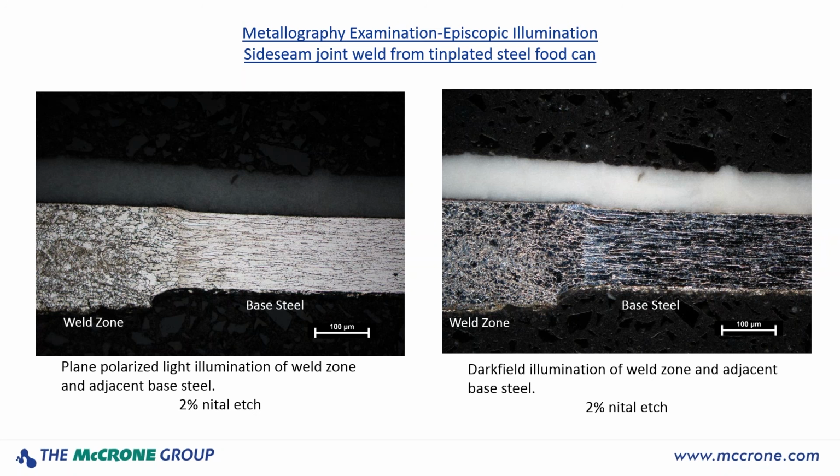And those reflections coming directly back up are actually blocked in the objective system so that we wouldn't see that. We're seeing the scattering of light due to angles and topography differences and so forth. So anything that's very flat is going to look quite dark.